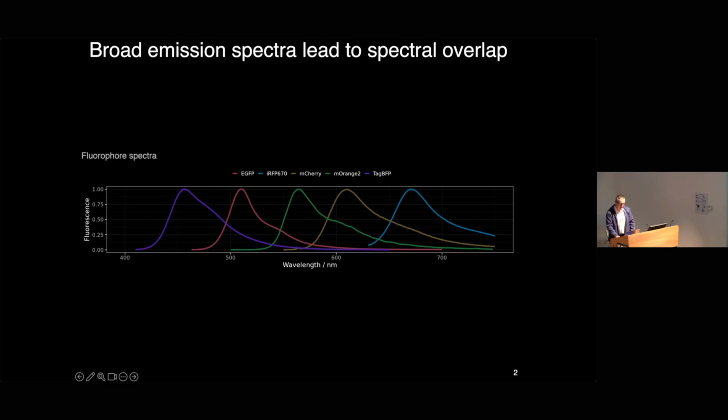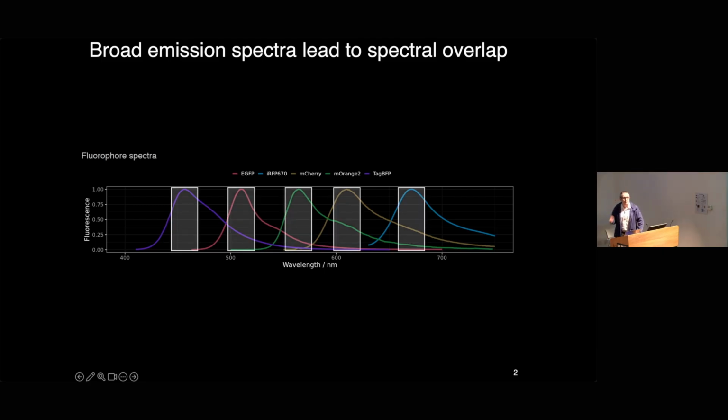And so if we try to pick 5 individual bandpass filters to filter out each of those individual colours, that works for the first bandpass filter where you see that nice blue emission, but then in all the other filters, you get a combination of 2 or more fluorophores at the same time. And so now there's no longer this one-to-one mapping between labelled component and what you're seeing. So typically in fluorescence microscopy experiments, people have 3, maybe 4 colours, and then that's it. They don't want to go any further because of this spectral bleed-through problem.